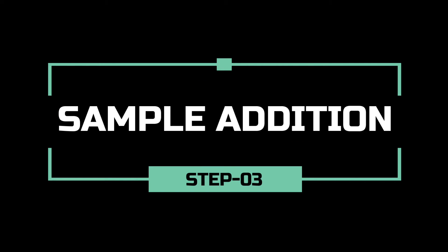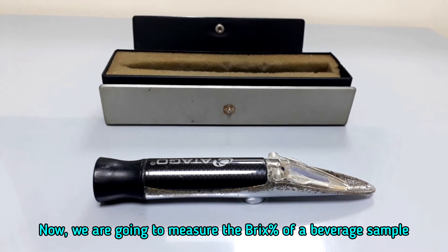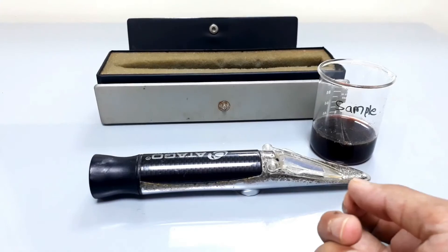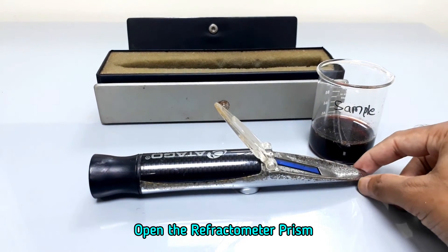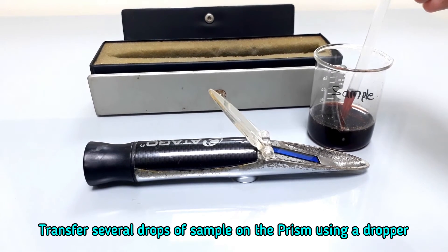It is the time to test our sample. We are going to measure the Brix percentage of a beverage sample. Bring the sample maintained at 20 degrees Celsius. Open the refractometer prism and transfer several drops of sample on the prism using a dropper.